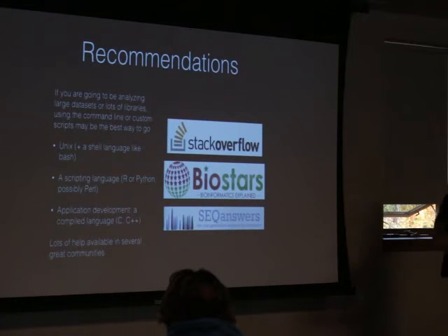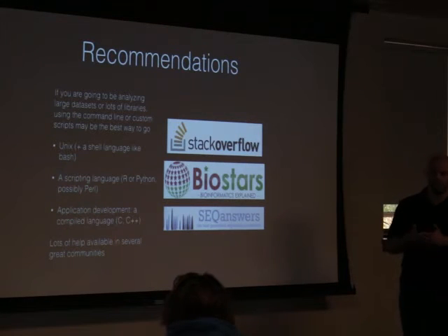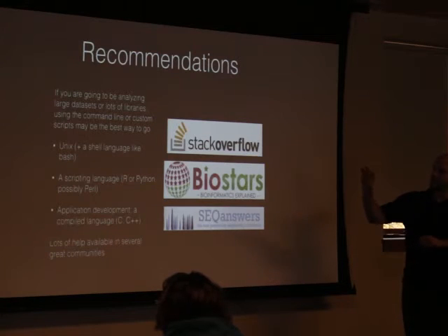So something that's recommended I talk about briefly is what skill set you ought to develop if you're going to be interested in doing more programming and a lot of high throughput sequencing analysis. My recommendation is that you get very comfortable with a Unix environment. There can be many flavors of that. Plus a shell language. Now, I recommend Bash. There are other shell languages. Most people in here are probably most familiar with Bash, and that's a good starting point.